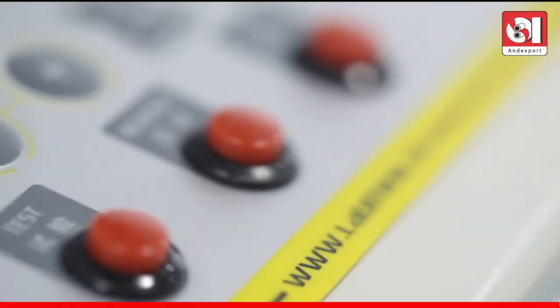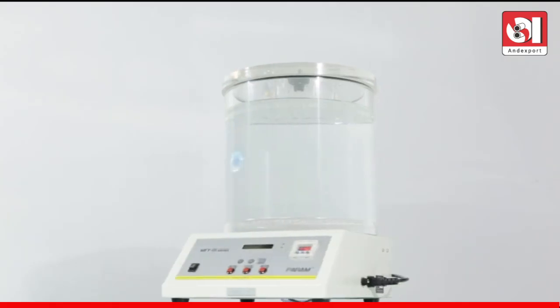MFY-01, your excellent choice for automatic leak testers.